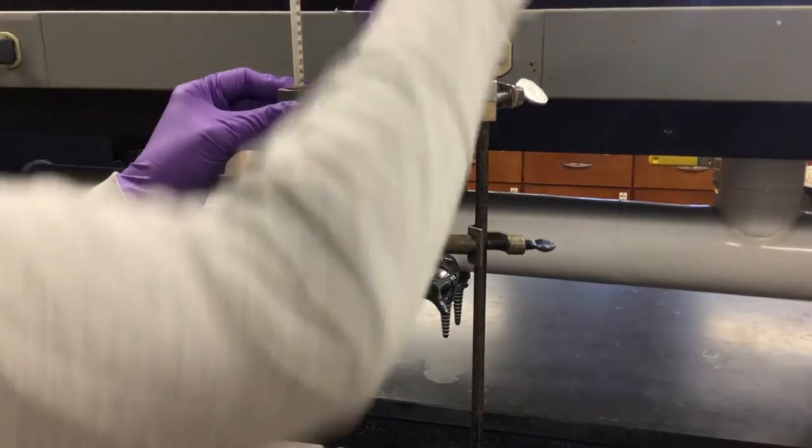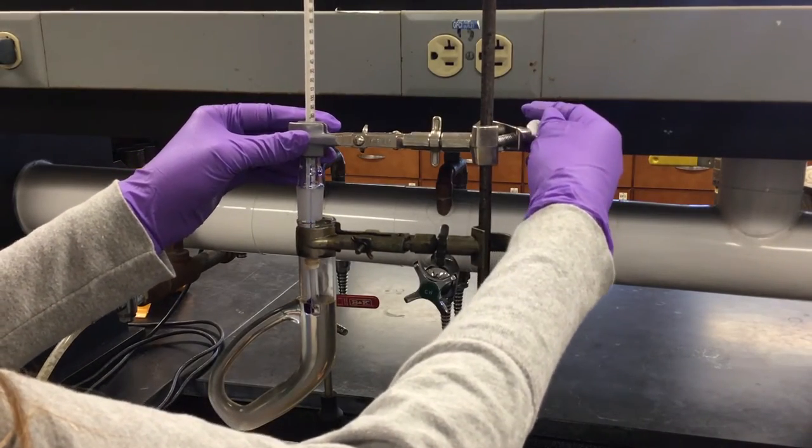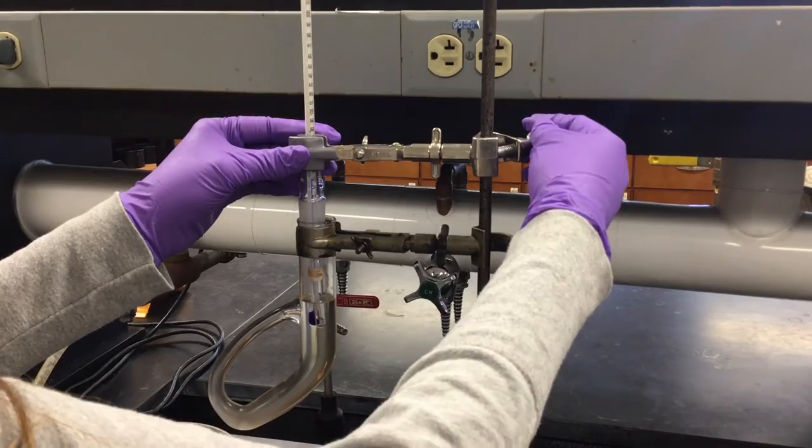Using a second clamp to hold your sample, lower the thermometer into the boiling point apparatus. You do not want it to be flush. You want the rubber band to be above the oil.